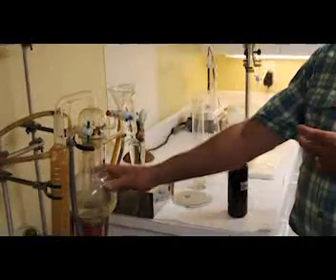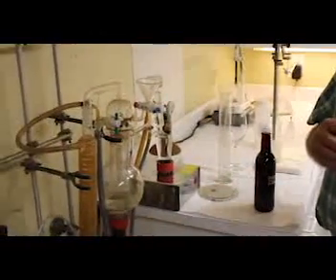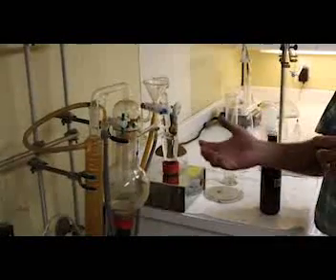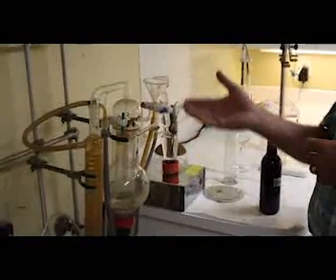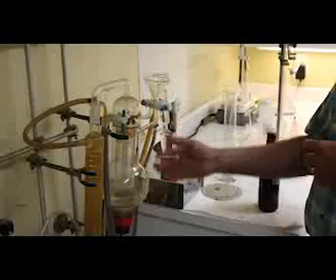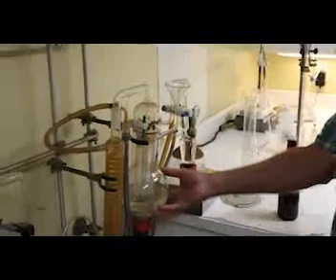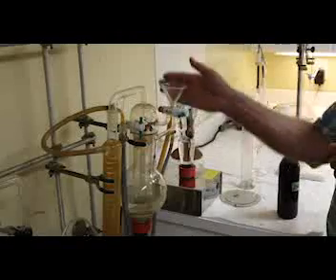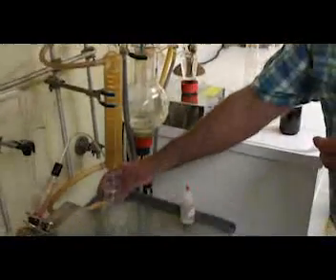And what we use is a Cash still, and that's what this unit is here. It was invented by a guy named Cash. He worked for Gallo, and when he invented this apparatus, we put 10 milliliters of sample of wine in here, and then in a water bath we boil the sample and distill off the vinegar into a distillate area here.